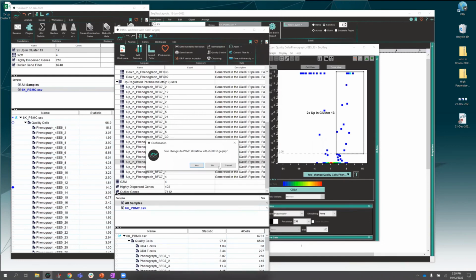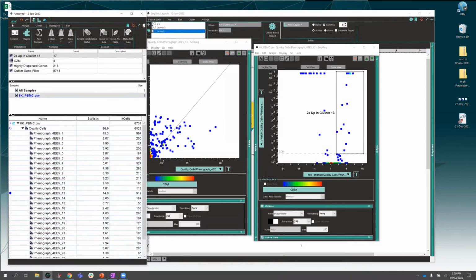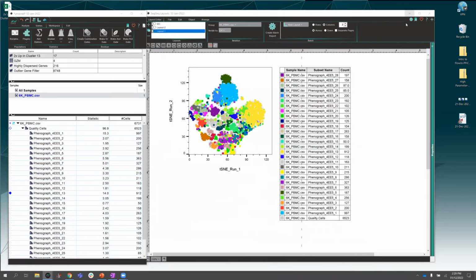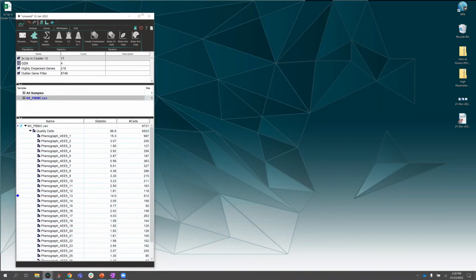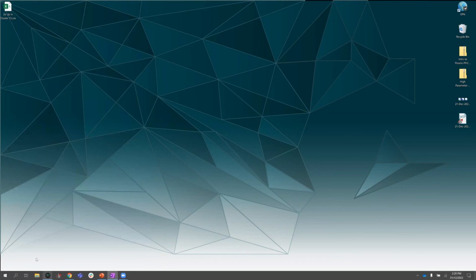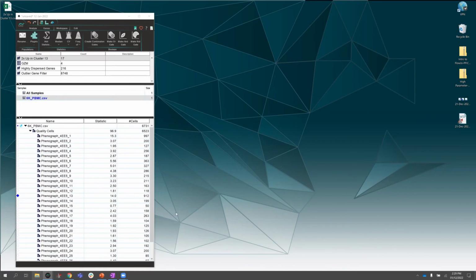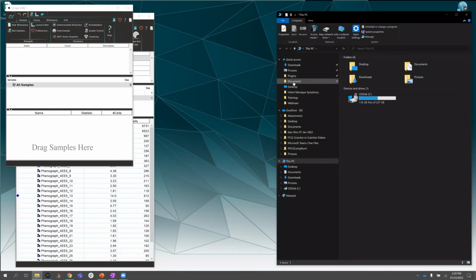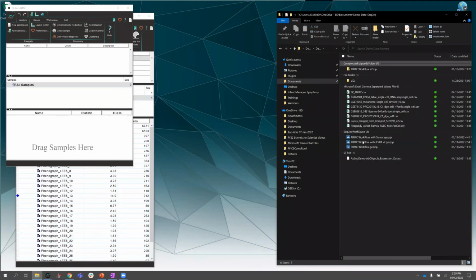And then in terms of pipelines, we do also have automated pipelines in the form of plugins, which can basically do everything from quality control to clustering to dimensionality reduction, everything of that sort. So I can also show quickly what something like that would look like. If I was going to run the plugin Seurat, I would choose that plugin. Let's go ahead and open a new workspace so we can look at it. Just gonna look for it here.